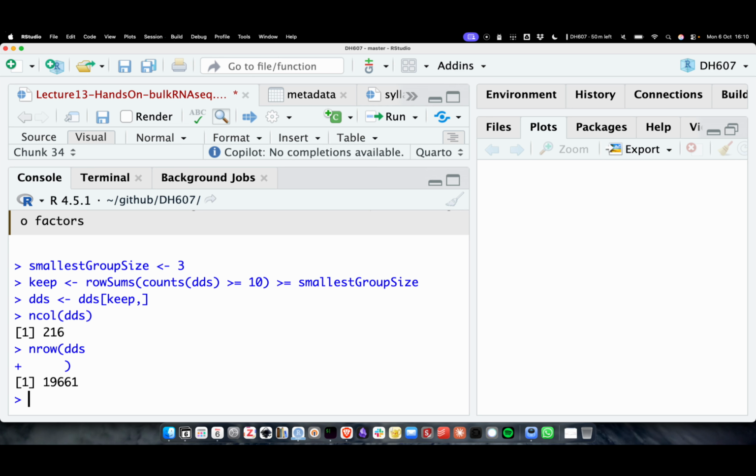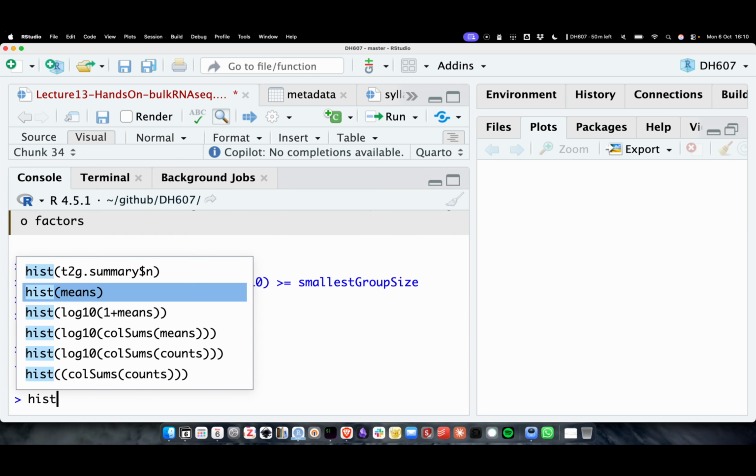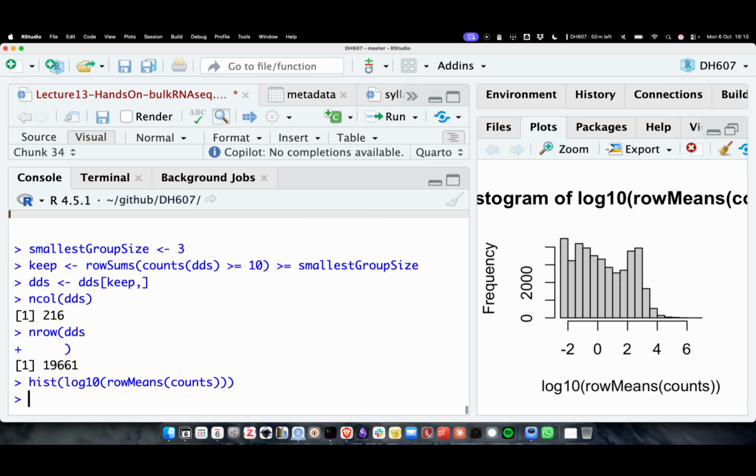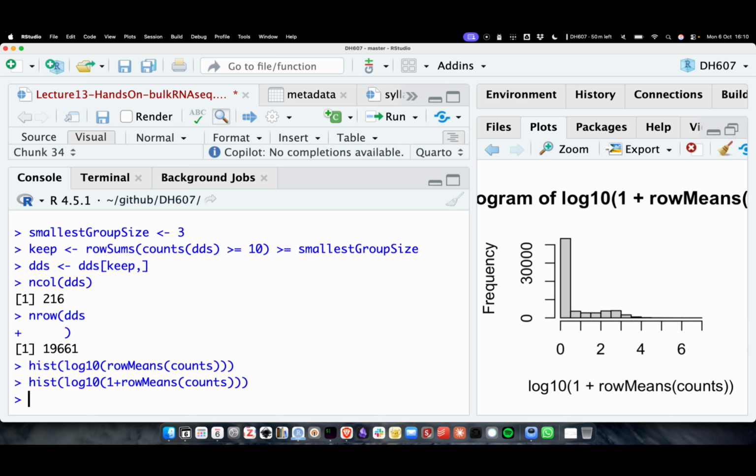So there were a lot of zeros, which is why I drew the previous plot, where we just did the histogram of the row means. There are a lot of samples which have a lot of negative values, right? So that is something which should be this. Sorry. So we don't want that. Whenever you're doing log, it's always a good idea to add something to it so that the minimum is 0, so you have a reference to compare against. So we have very lowly expressed genes. We want to remove them, and we now only have 19,000 to work with. Okay, we'll proceed.